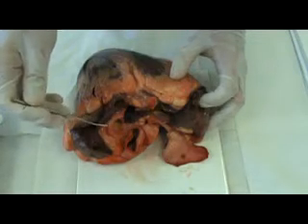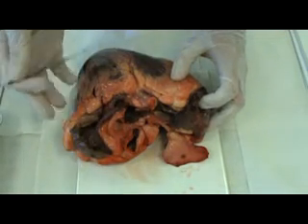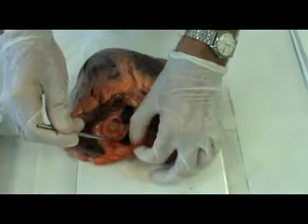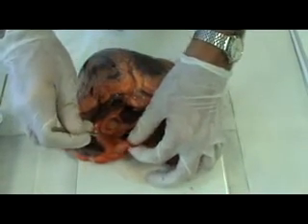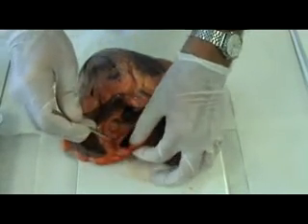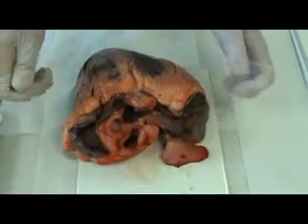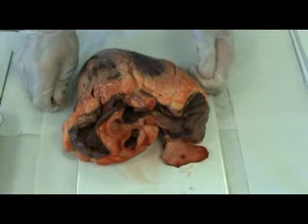If we move across to the right side of the heart, we can also see a number of other blood vessels, and here we can see one of them. It's much thinner than the aorta, and that would be part of the vena cava, and this is carrying deoxygenated blood back to the heart, and this would enter the right atrium.